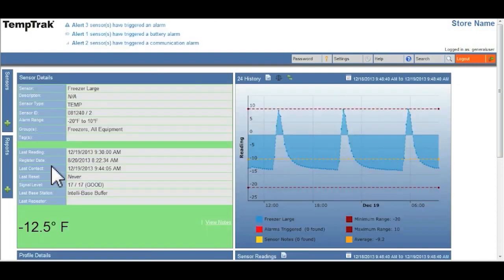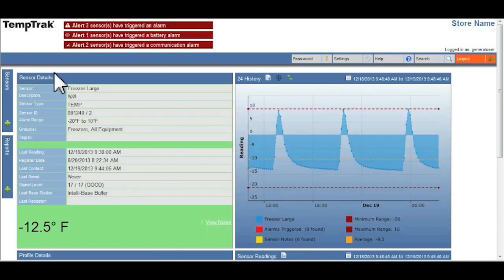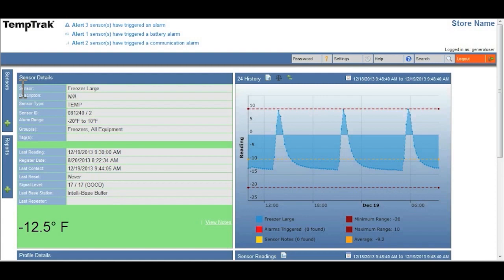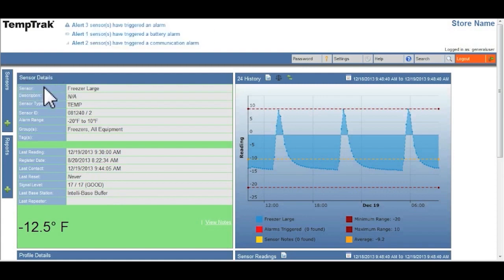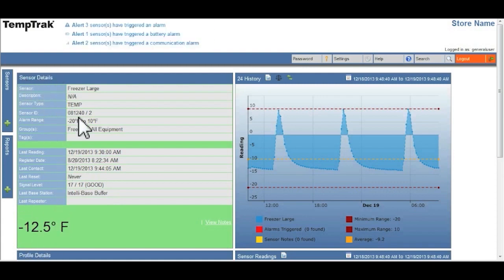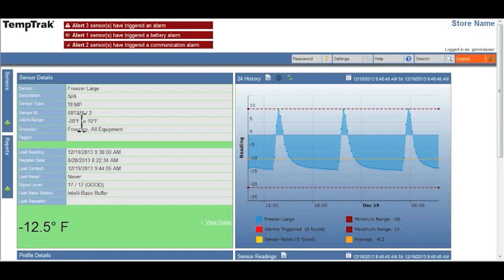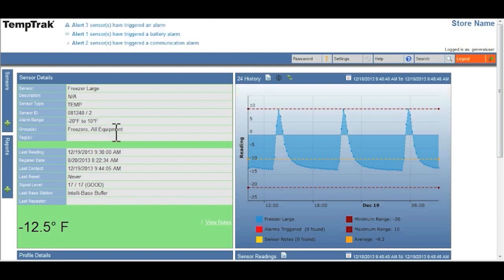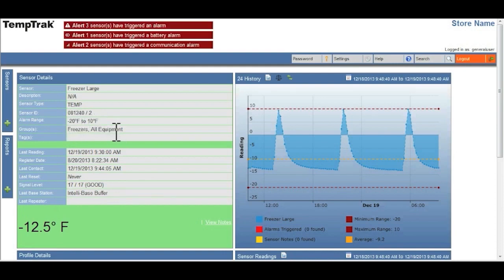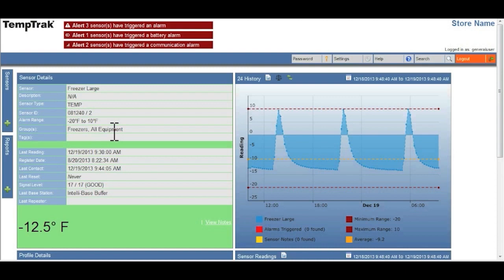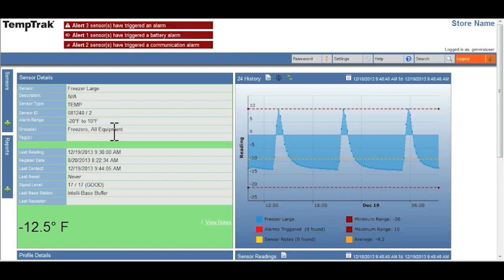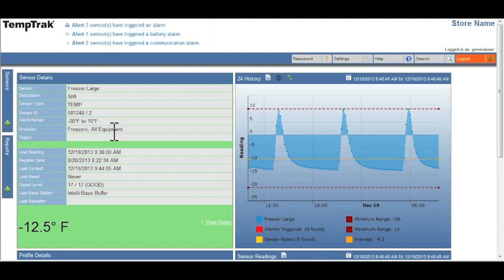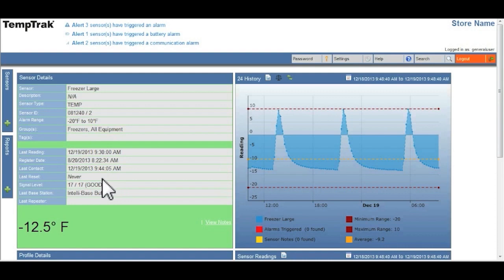The sensor details section in the top left identifies the sensor, its current temperature, sensor ID, the alarm range, if it's located within a group of other sensors, what group that is, the last reading, and whether or not the signal is strong.